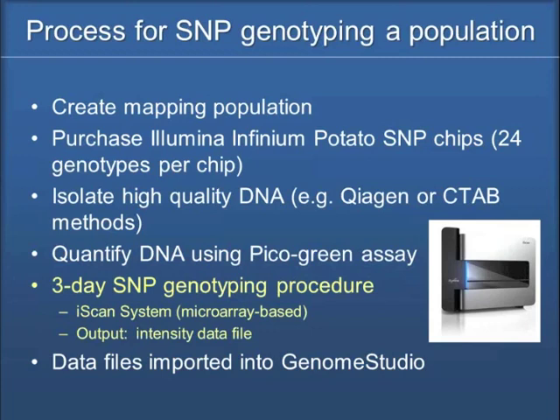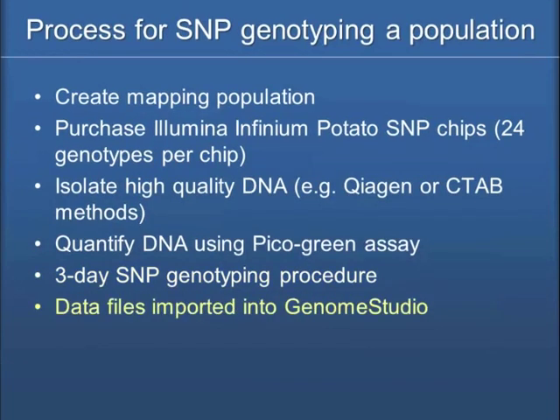So it's unlike a gel where you load a sample on, you got a well, and you got a band, or you don't have a band, or you think you have a band. I think this is actually more reliable data that comes off the scanner that's read.